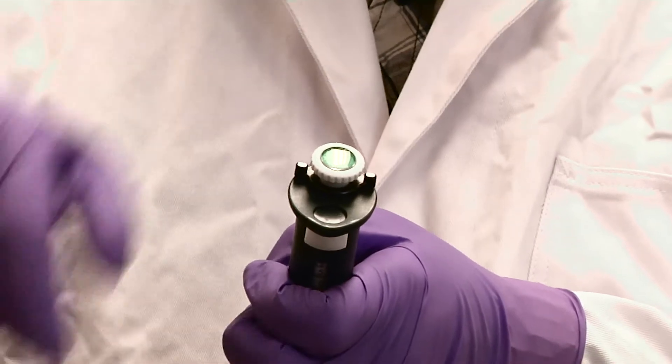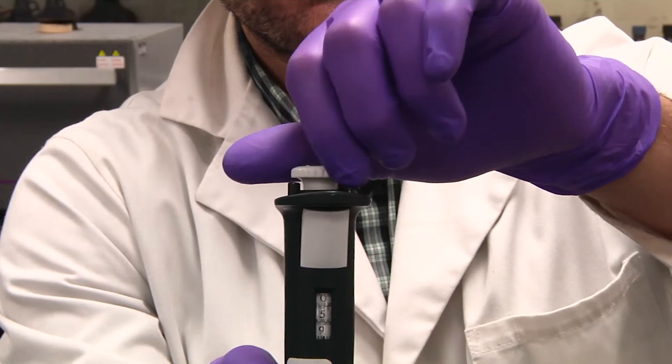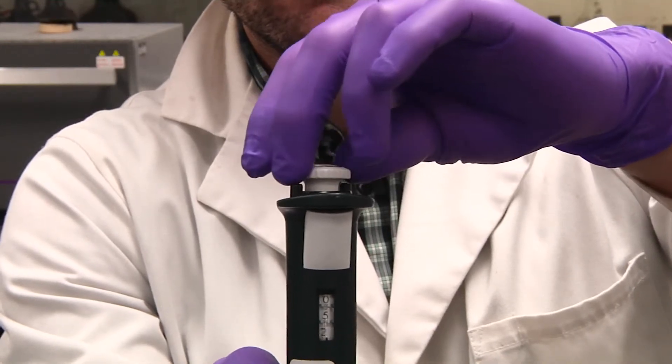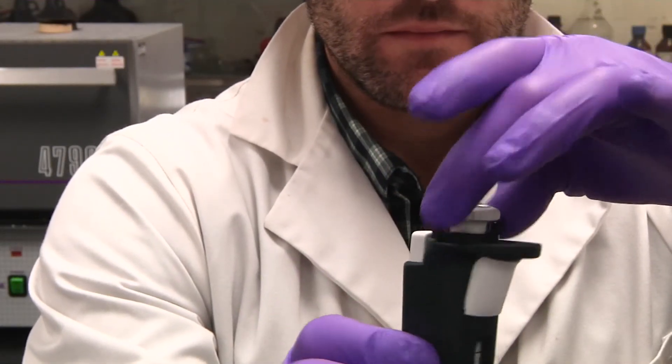simply turn the locking ring on top of the pipette counterclockwise to allow the volume to be set. Turn the white plunger on top of the pipette until the display reads 50. Lock the volume by turning the locking ring on top of the pipette clockwise.